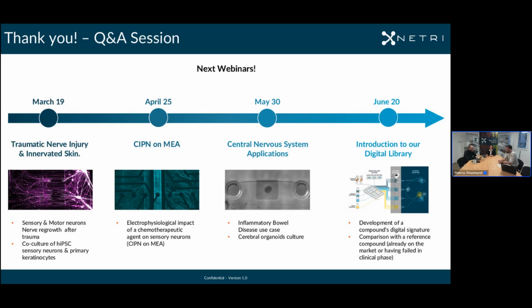Yeah. So yes, you can multiplex. Something we do routinely is having the electrophysiological recording, and then fix and have imaging readouts. But if you take the supernatant, you can have supernatant analysis either for viability, such as LDH, or you can do ELISA for neurotransmitter release, or you can also assess, for example, the presence of neurofilament.